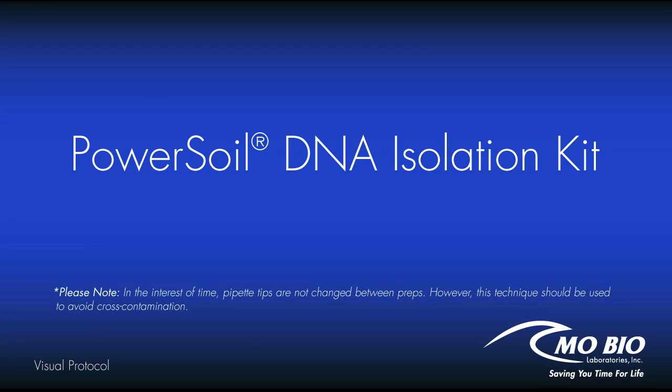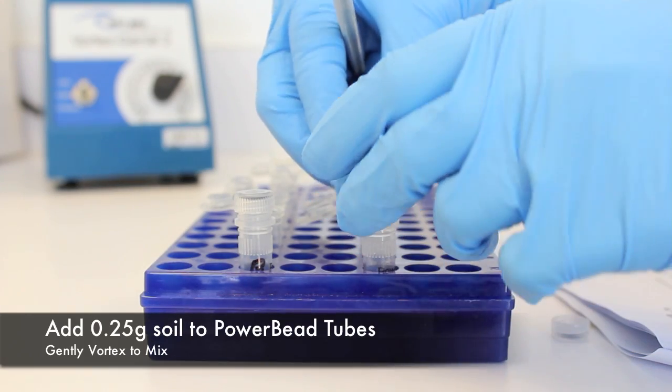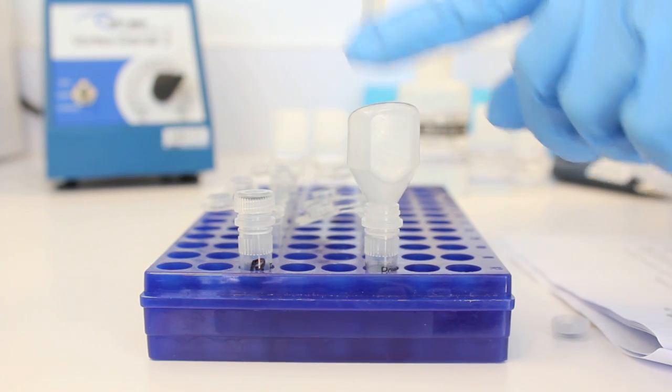This is a visual protocol of MOBIO's PowerSoil DNA Isolation Kit. Add 0.25 grams of soil to the power bead tube. Using a weighing funnel will make this process easier. Gently vortex to mix.